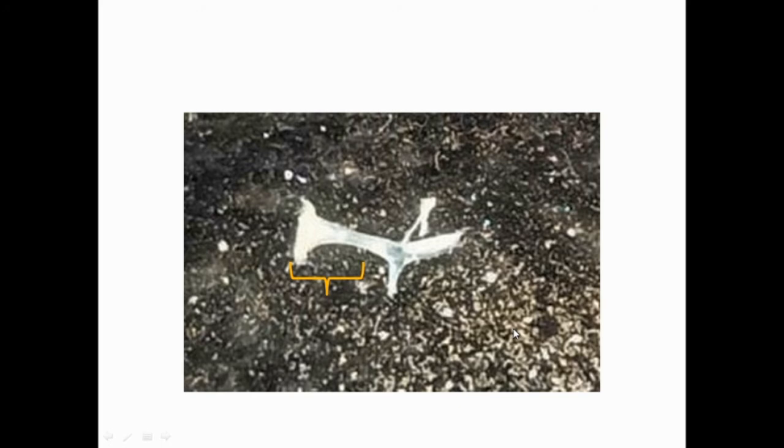This is the inner part, stapes, which has an expanded plate-like structure that fits into the fenestra ovalis. This is the outer part which is cartilaginous, called stapedial. It has the extracolumella and supra and infracolumella.